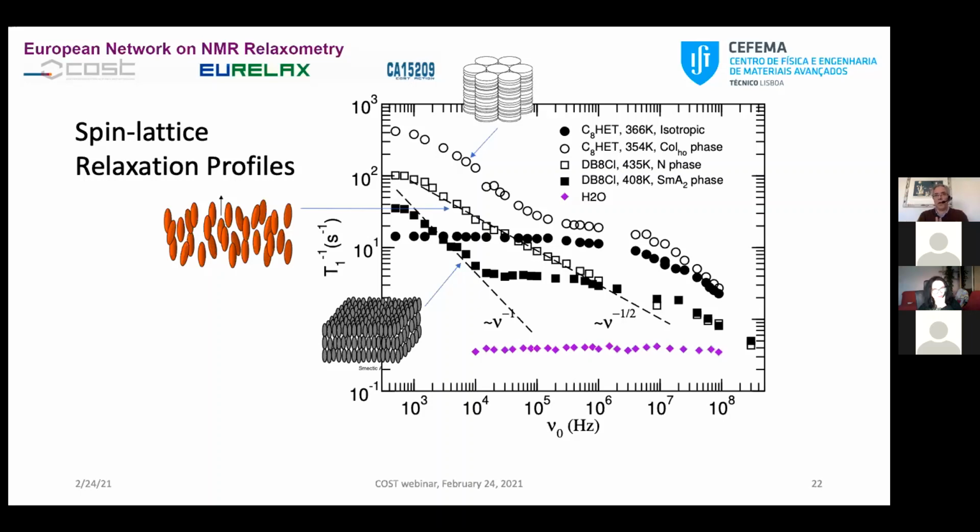So when you have a model-free or a parameter-free approach, and you have, let's say, 3 BPPs, and you have prefactors and correlation times, we should try to have an explanation for the prefactors and why they have the values they have, because they cannot just be arbitrary numbers, just putting into evidence a dipolar coupling constant, which actually they do, but at the same time we don't know why this dipolar coupling constant shows up in that particular BPP, how it is related with other physical parameters of the system.